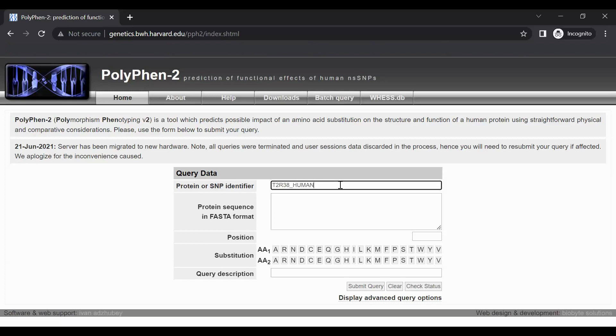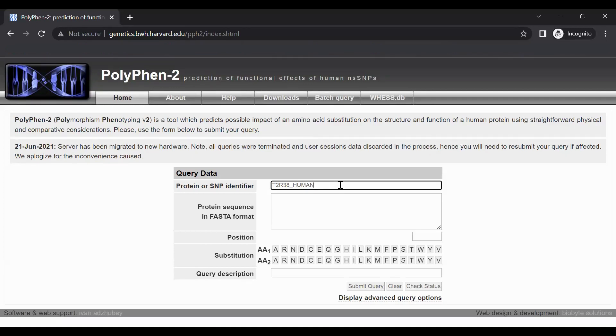You could also use the UniProt-KB accession number for human TASTER, which is P59533. When using a UniProt-KB identifier, you do not need to enter the protein FASTA sequence into the query submission form, so we will skip that section of the form.